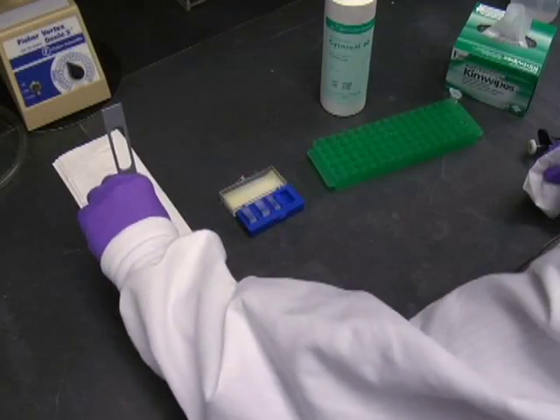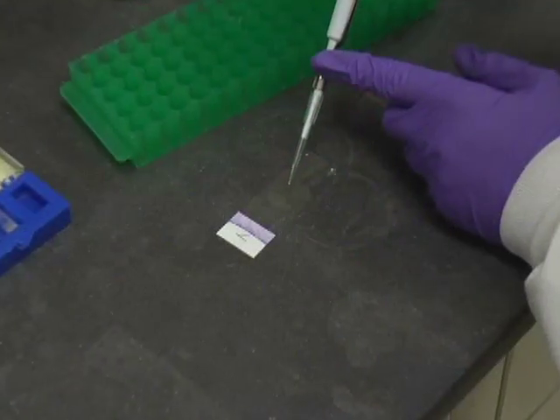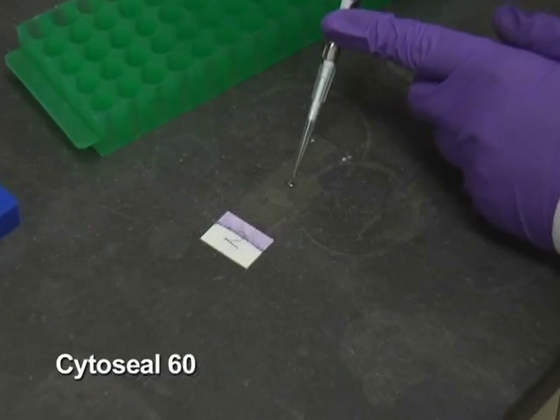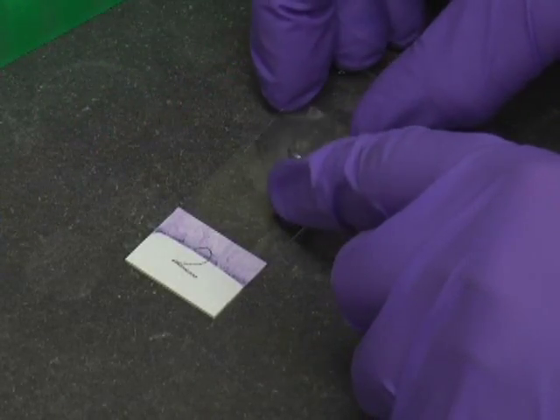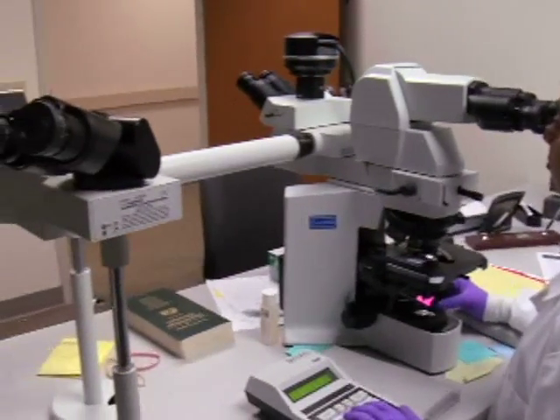Remove each slide and wipe the back of the slide with methanol-soaked kimwipes to remove stains. Place a drop of Cytoseal 60 and a cover glass to seal. Perform a 500-cell differential count for each Wright-Giemsa stained slide using a microscope.